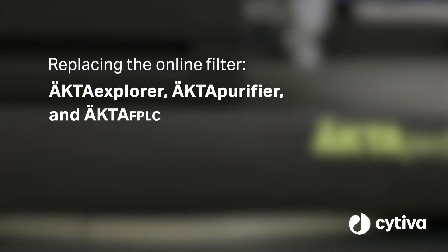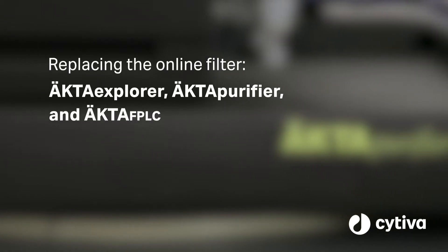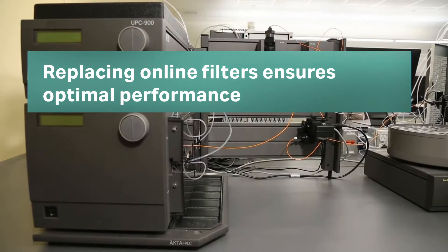A dirty online filter can cause high system pressure and may limit your ability to run your columns at the desired flow rate. Replace your online filter regularly or as needed to ensure optimal performance of your ECTA system.